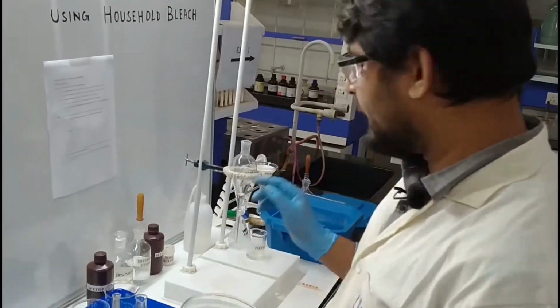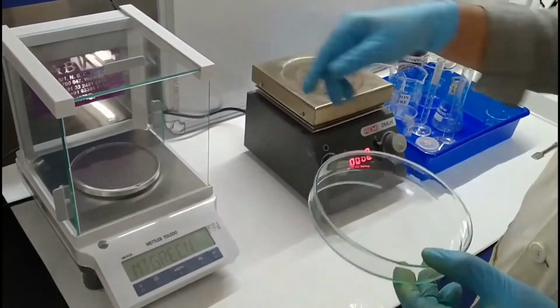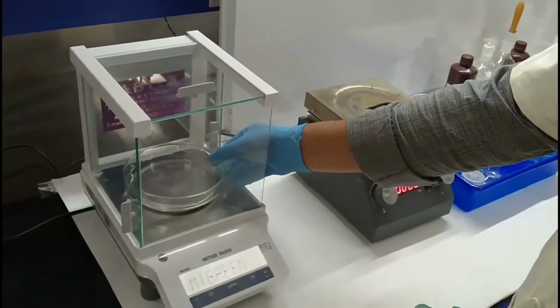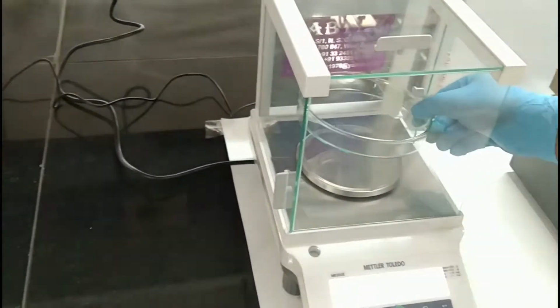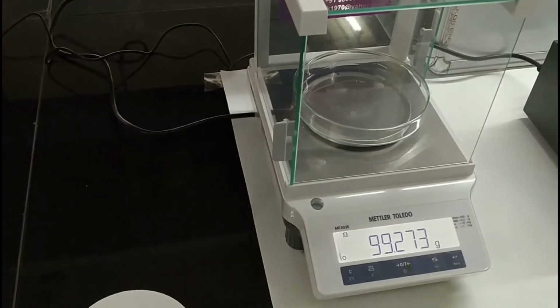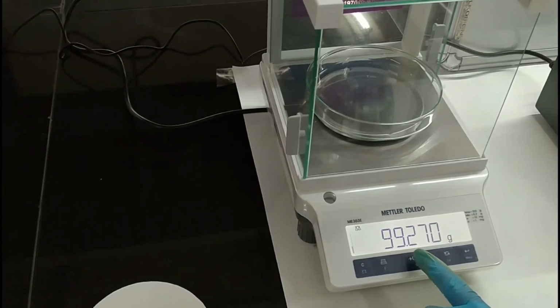Okay, so let it be filtered, and in between we are going to take the weight of this petri dish. Now we set this as 0.